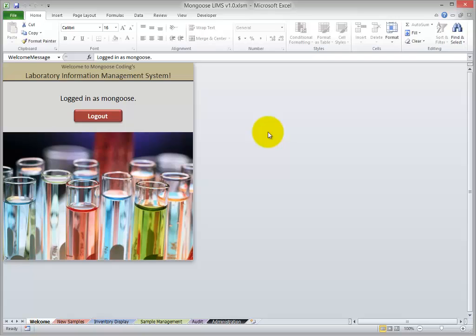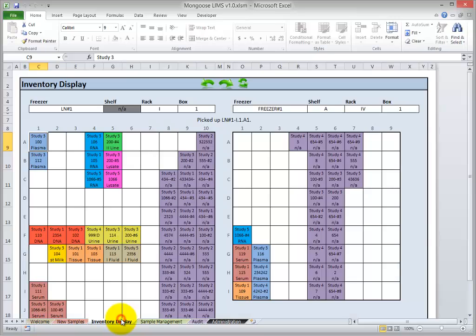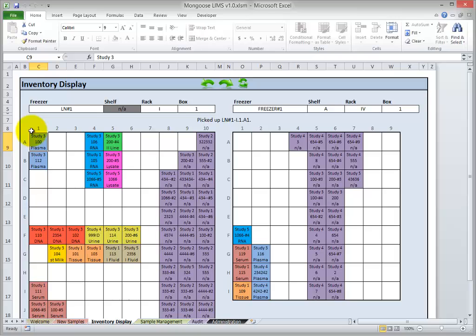So we're back at the LIMS now. We're logged in, and let's start with the Inventory Display tab. You're looking at a visual representation of two boxes in your inventory. You can see that Freezer 1 has boxes that are 9 by 9, and the Liquid Nitrogen Freezer has boxes that are 10 by 10. The LIMS can support all shapes of boxes: pie shapes, circles, rectangles.